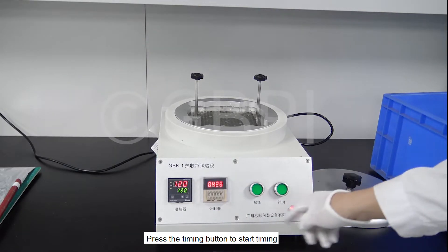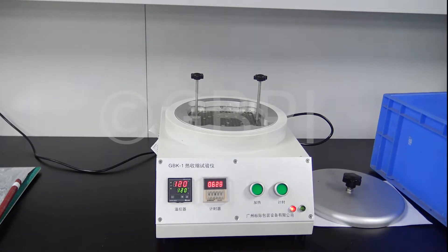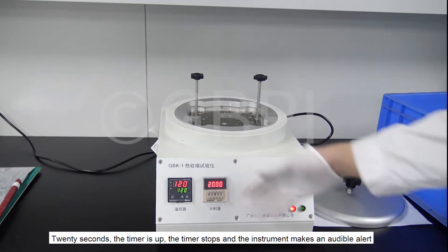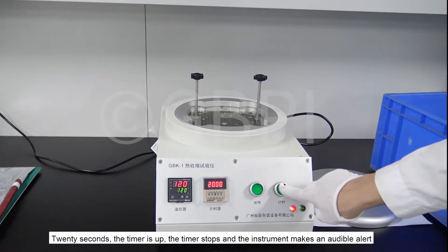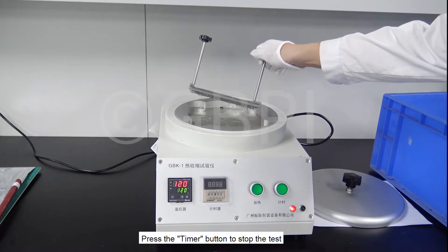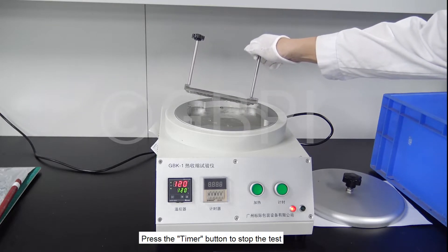Press the timing button to start timing. After 20 seconds, the timer is up; the timer stops and the instrument makes an audible alert.